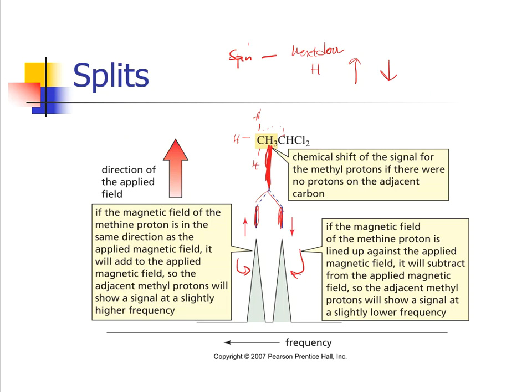And as you can imagine, in this example, we just had 1 hydrogen and that is it, right? But what if the next door carbons have 3 hydrogens or 4 hydrogens? Well, this is the concept of why things are splitting in more than 2 signals, because each one of those hydrogens could be aligned with or against the main signal.